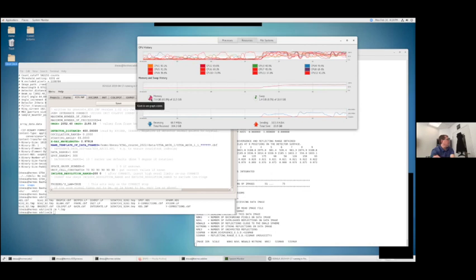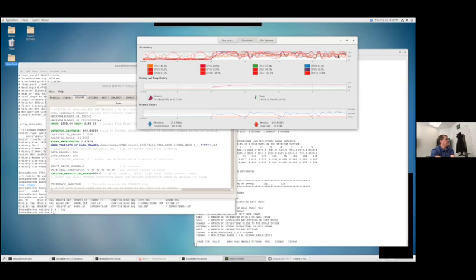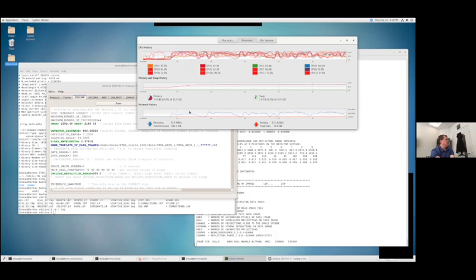We're running with 2 jobs, 4 processors, so we're maxing out 8 CPUs at a time, and we get this variation in processor use. If I had 4 jobs, 4 processors, these lines would all be maxed out at 100%. It's using 7.6 gigabytes of my 11.5 gigabytes of RAM.